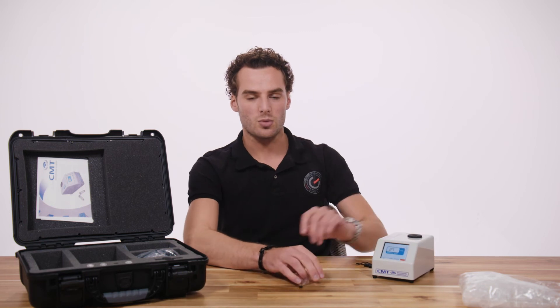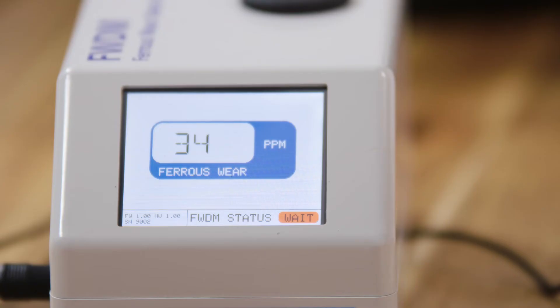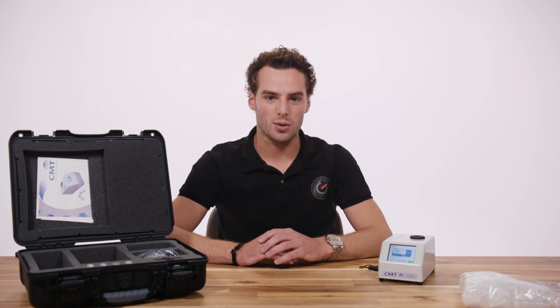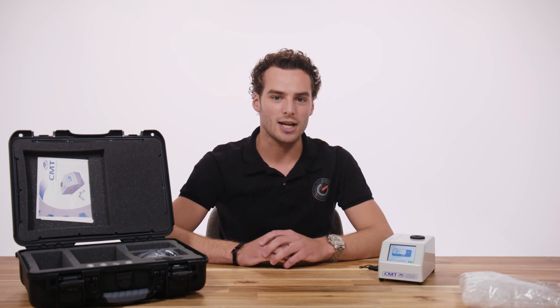To do a new test, wait for the status to switch back to 'ready' in green and repeat the process. Test your oil on a weekly basis. The absolute value can vary quite a lot between different applications. Most important is to monitor the trend for significant increases, and if you see changes of more than 50 ppm, in most cases action is required and you should start to search for the cause.